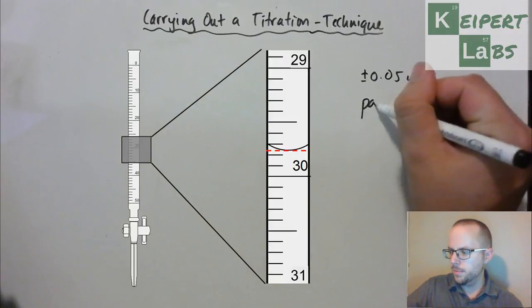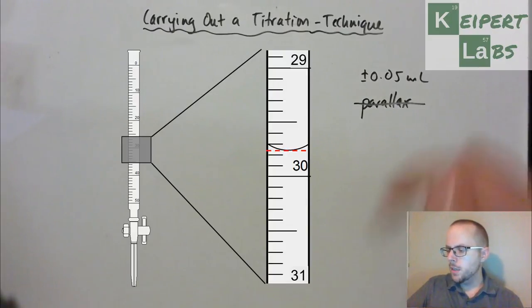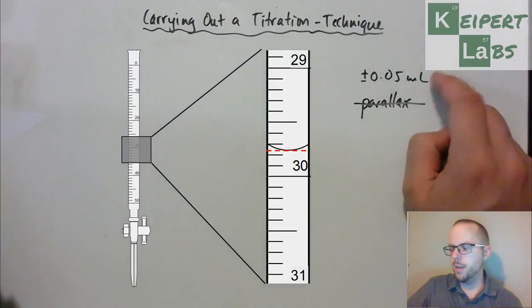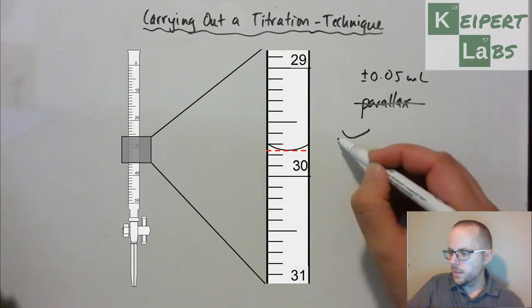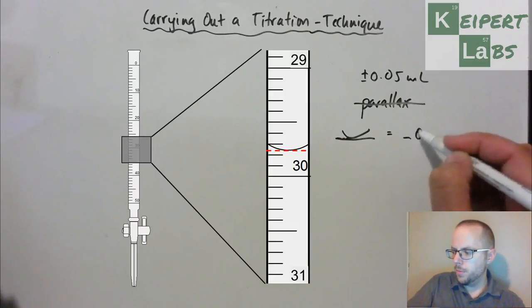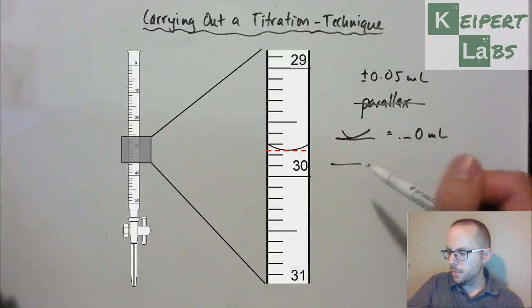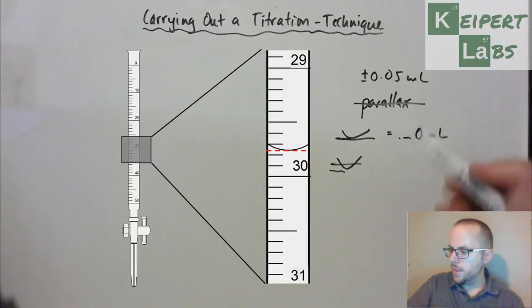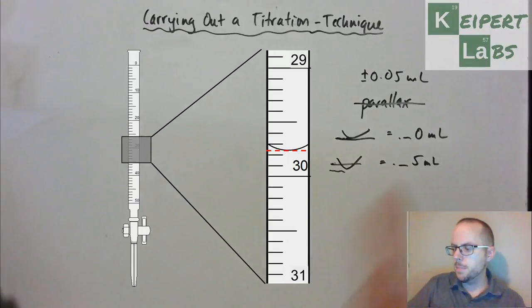So you've got to minimize parallax error. We want to make sure that we are getting down at right angles to where that scale is. You're not reading it from down below or up above. And then what we can do, like I was saying, is that you can only record our values to the nearest .05 of a mil. So that is, if it's on the line, so if this was our line marking, then we would have something zero, something zero mils. So a zero in our last decimal place. Whereas if it was between maybe that and here, then we would have point something five of a mil. So that reflects that it's between the lines, but we're not trying to estimate any closer than that, because you just can't.